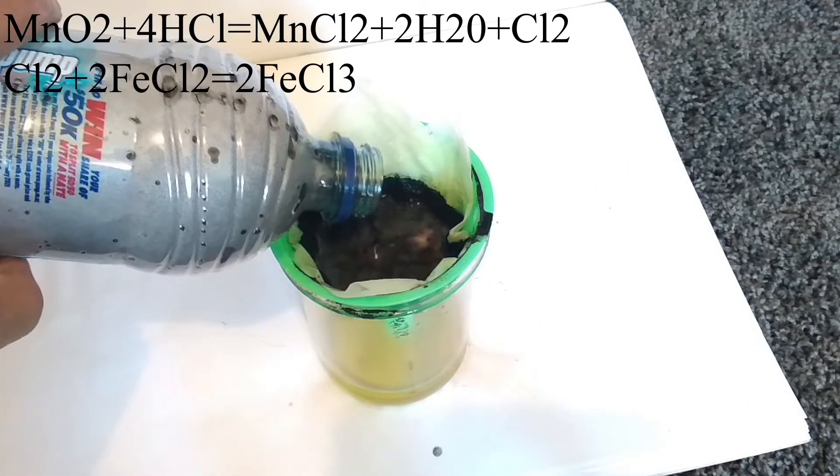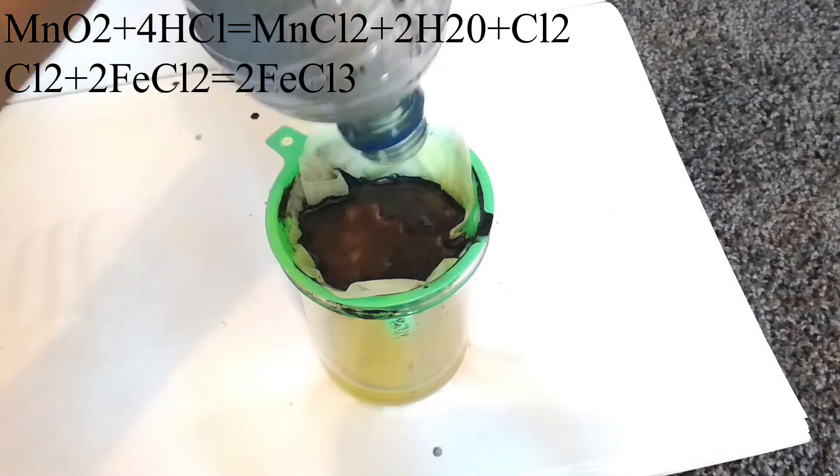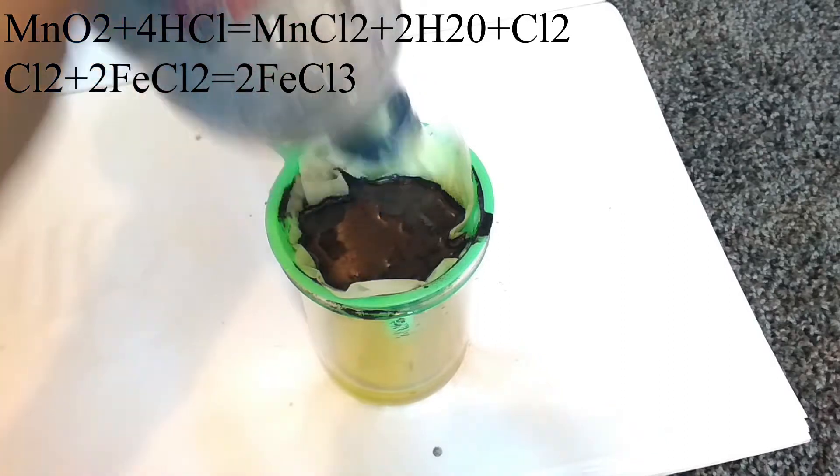Then we filter it. When it's done, the resulting solution is very gross and yellow, so it's clearly impure and full of contaminants.